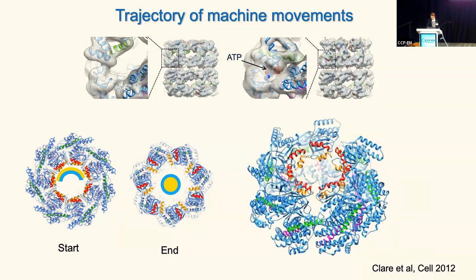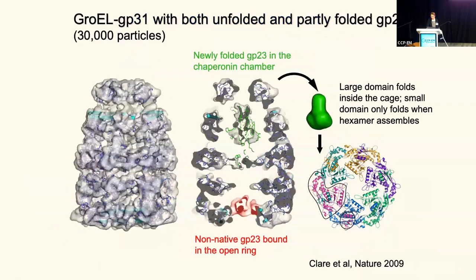And then the next thing was to look at a substrate inside the cavity. Dan got stuck with me for quite a long time. And this was a big viral capsid protein, and you could really see that it was a very big substrate. We wanted big ones so they'd be stuck inside. And this thing is pear-shaped, and it really did fill the cavity.